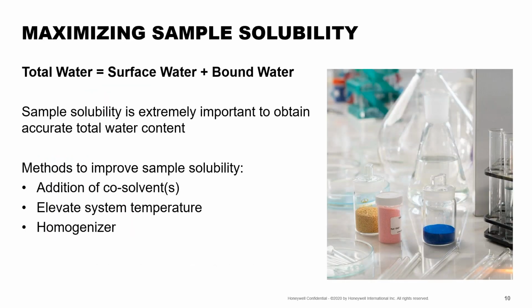Now, you might be asking yourself, why do I even care about sample solubility? Especially if I have a liquid, I'm just injecting the sample, I'm going to measure the water content. Well, for the majority of us, when we want to be measuring water content, we're interested in the total water that's contained within a sample. This is because this can have product shelf life, active ingredient activity, some side reaction down the line implications. So we care about the total water, not just the surface water present on the surface of the sample.